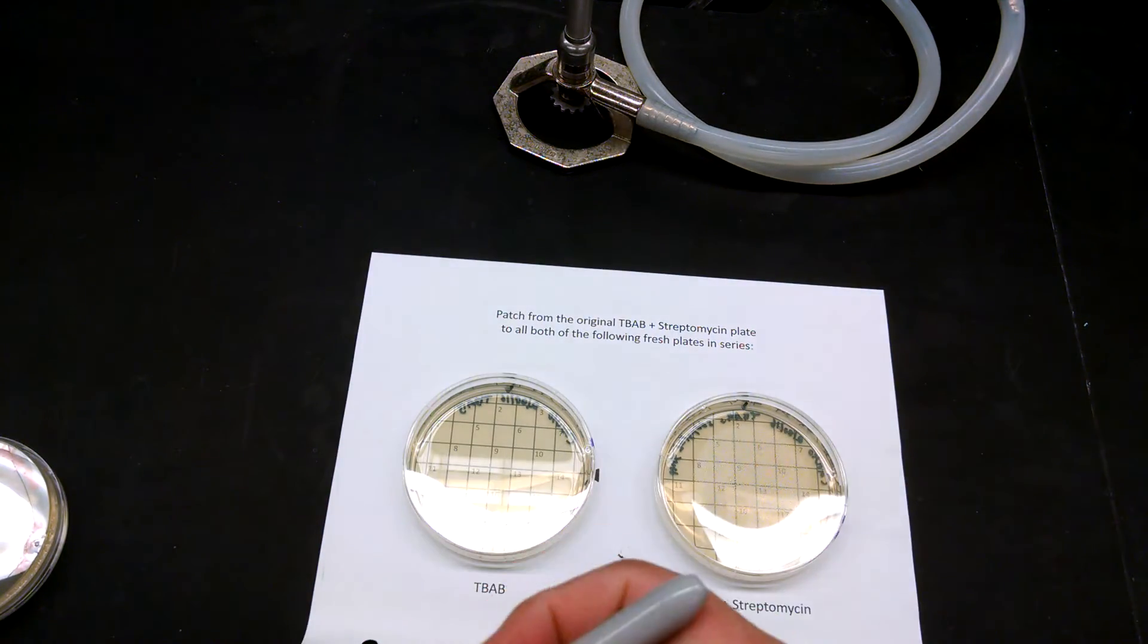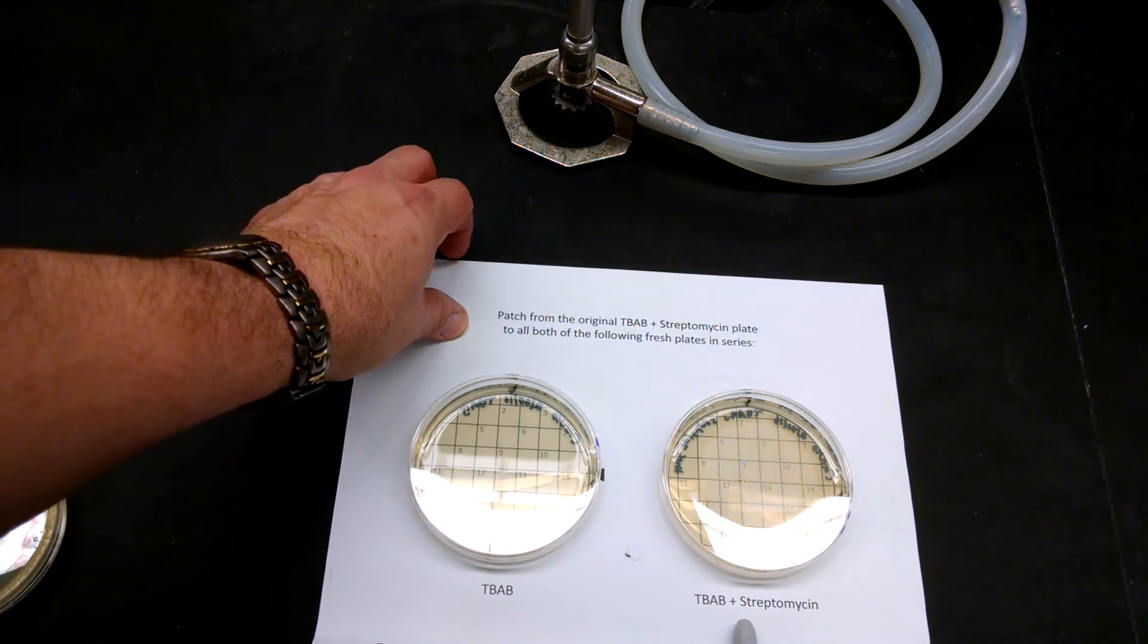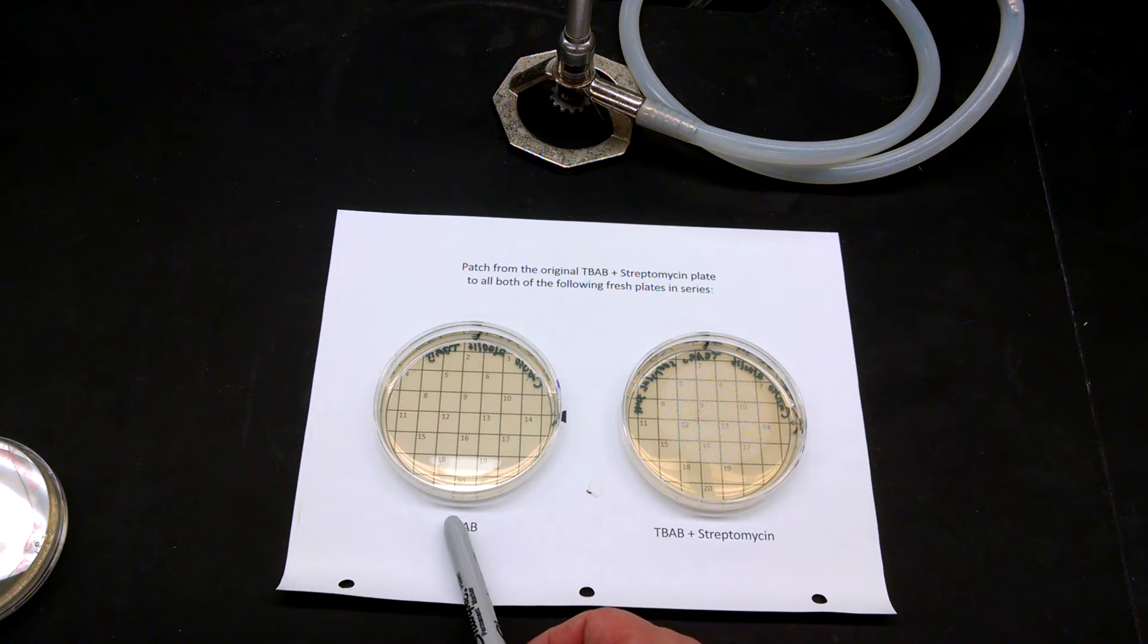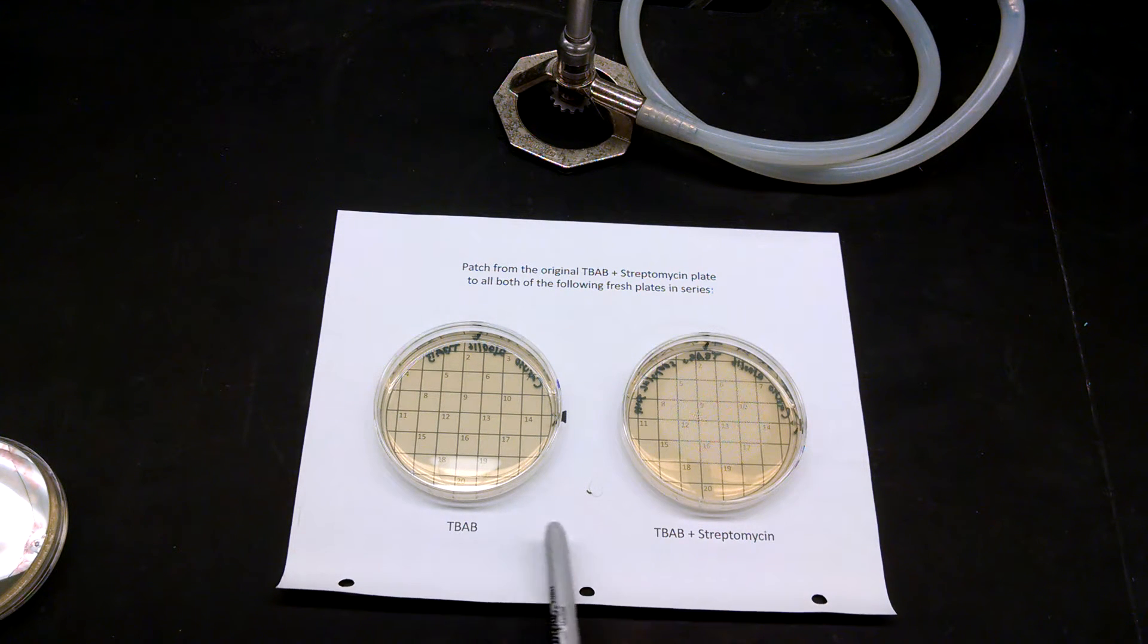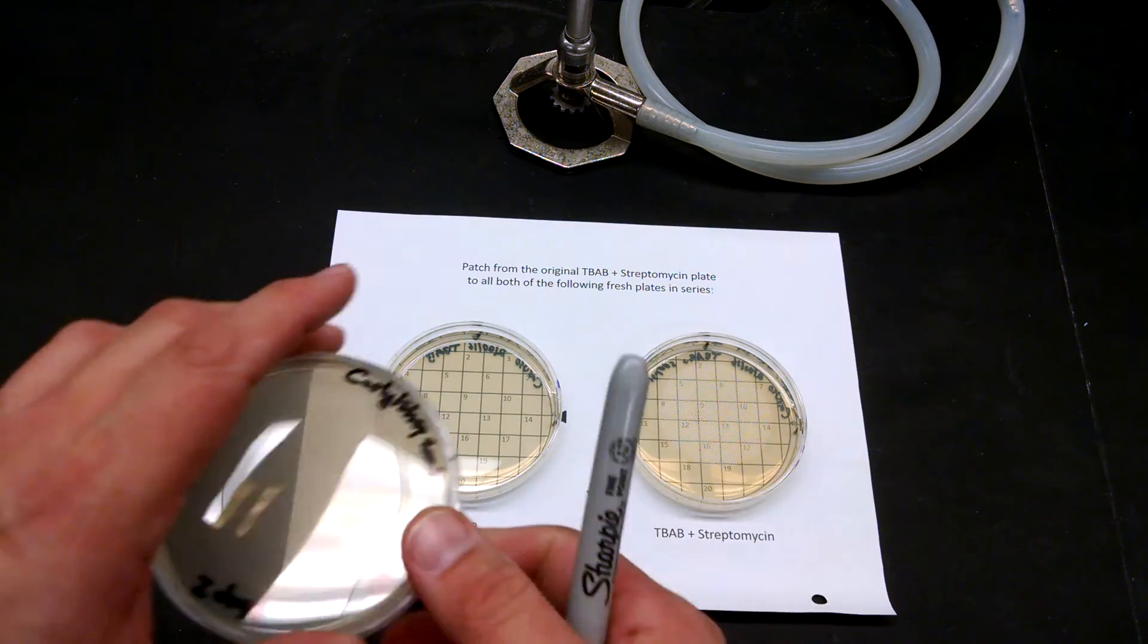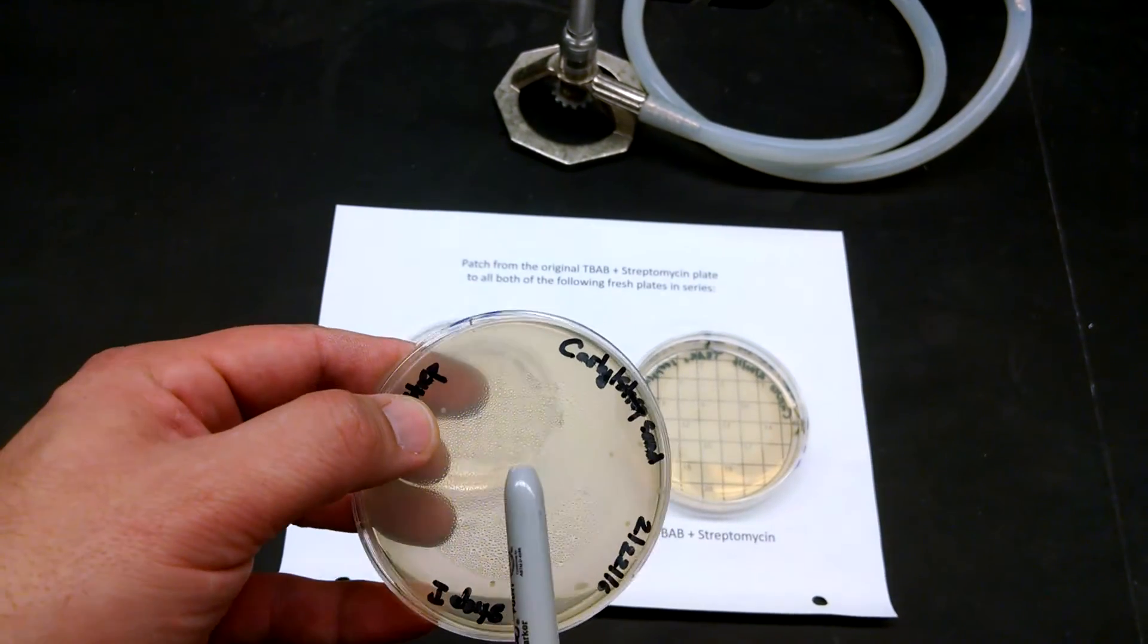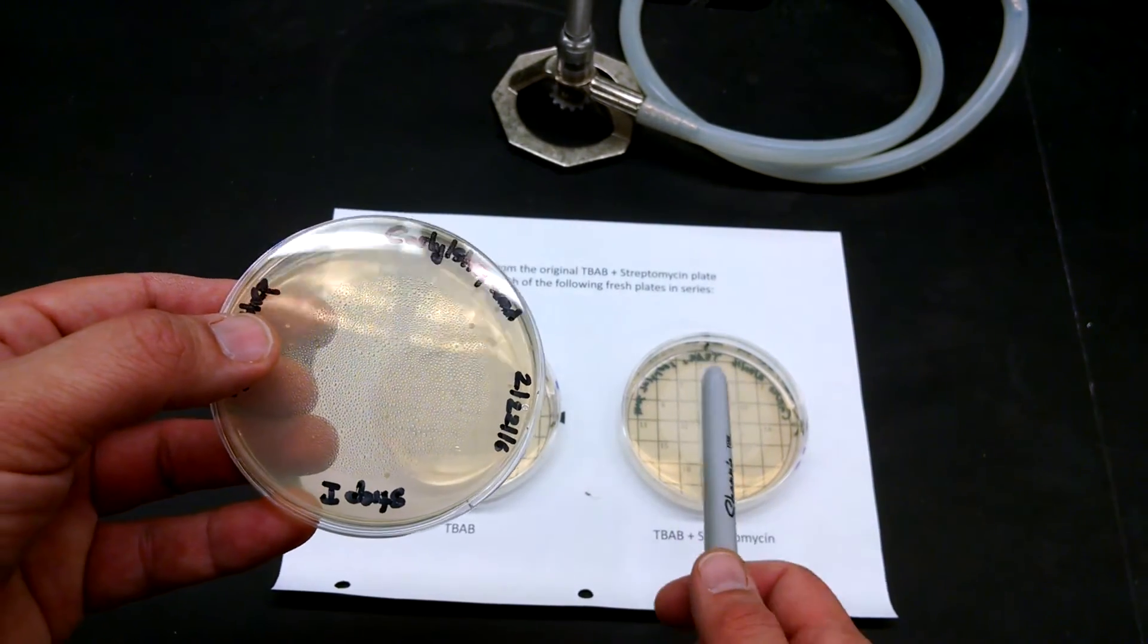And you'll see they line up with those arrows. Now you'll notice that this, if you can read it, says TBAB and this says TBAB plus streptomycin. The order actually matters. We're going to want to patch onto the new condition first and then patch onto the same condition we're patching from. Because our colonies grew on TBAB plus streptomycin, we already know they can grow on this. So we want to put that on there last as a control.